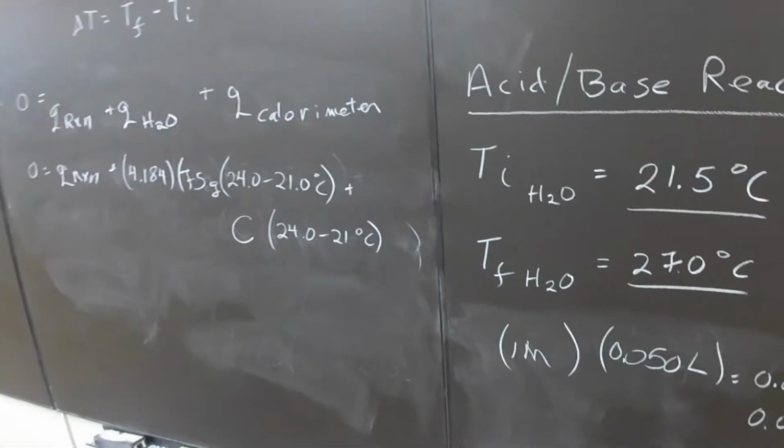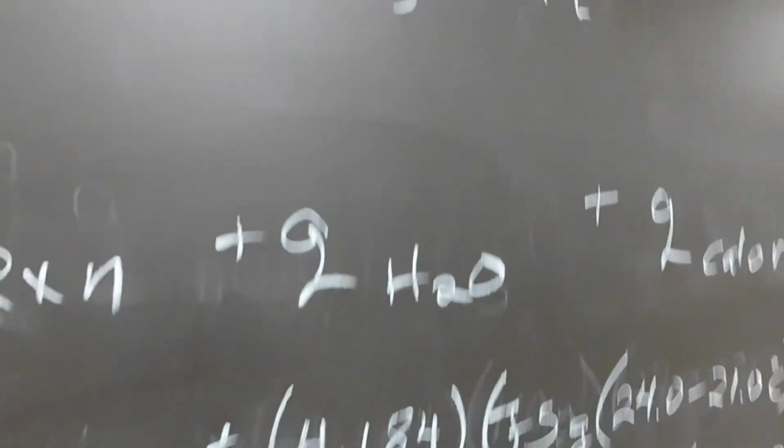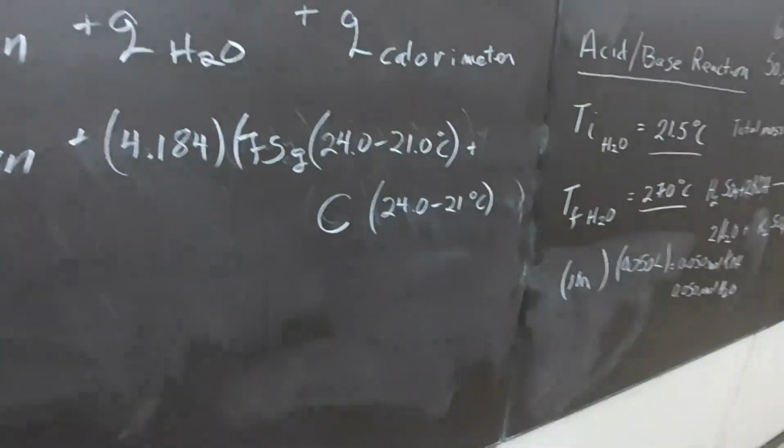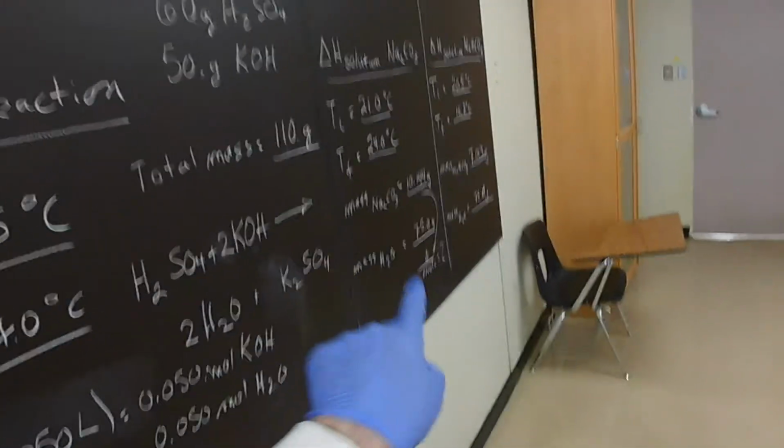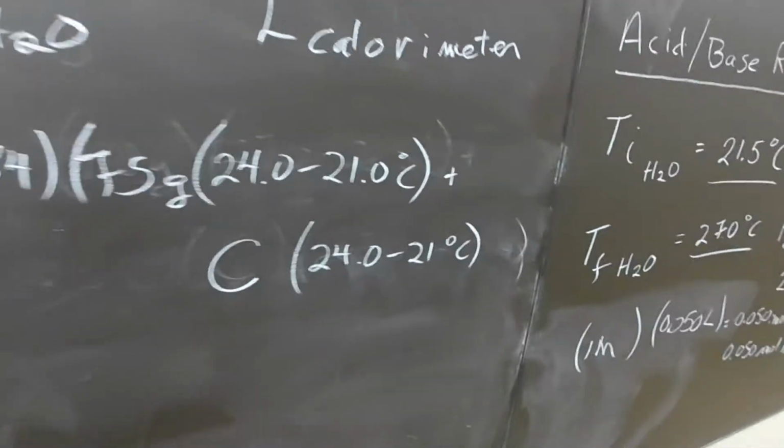All right? You may have to pause this video several times, particularly for the parts where I made a mistake, and then go back and review the different parts, because the calculations are not that difficult if you're methodical and use 0 equals everything else that happens, because the system is isolated. You need to calculate the calorimeter constant because it has to go into every calculation for the following 3 experiments. Right? So I'm going to leave that up to you.